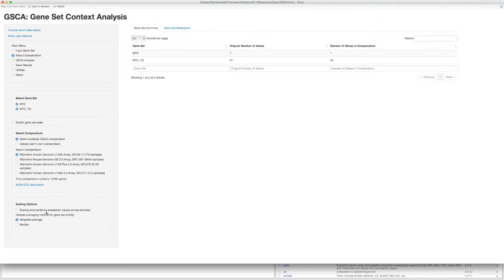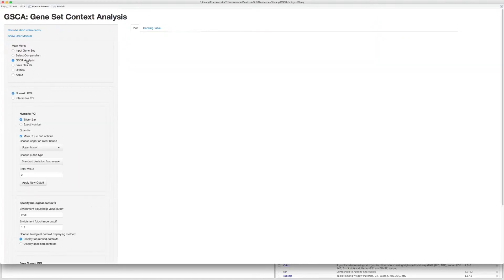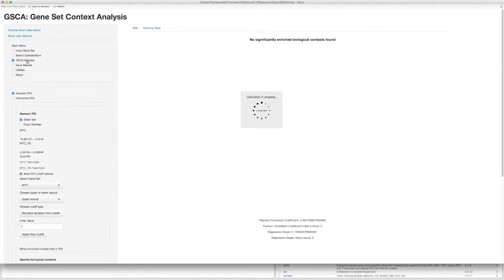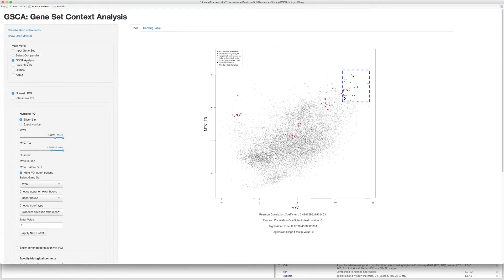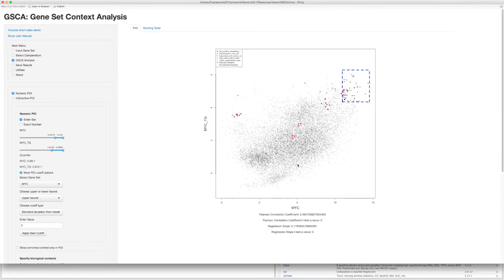Now let's go to the third step to run GSCA analysis. For two gene sets, GSCA will display a scatter plot where X and Y axes represent the gene expression values of the two gene sets. Each dot in the scatter plot represents a sample.